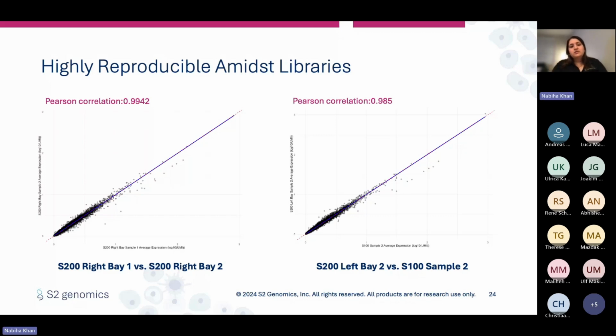So even the least well-correlated sample set had a Pearson correlation of 0.985. Every comparison was above 0.985. So this indicates that the expression patterns of genes in these 6 samples are highly similar, with little variation between them, confirming that the Singulator platforms are in fact reproducible.